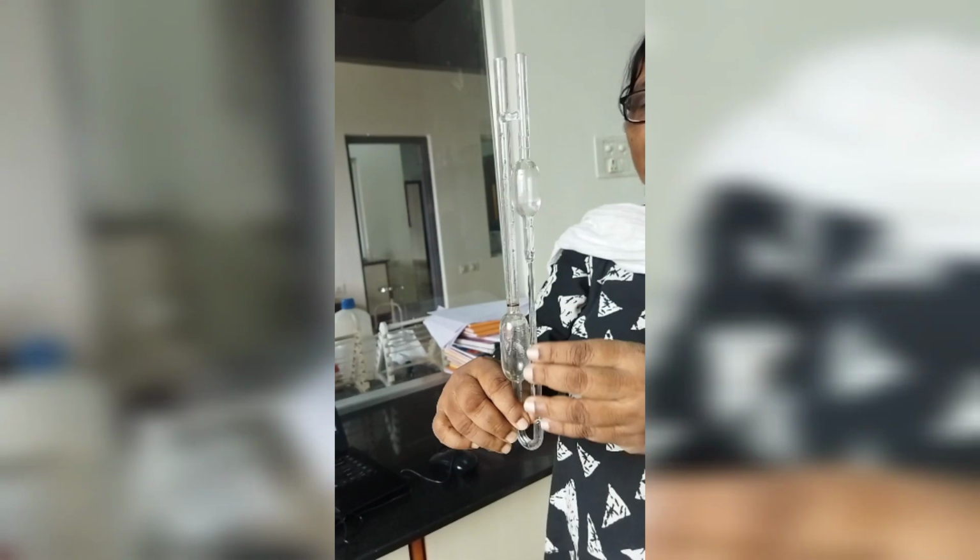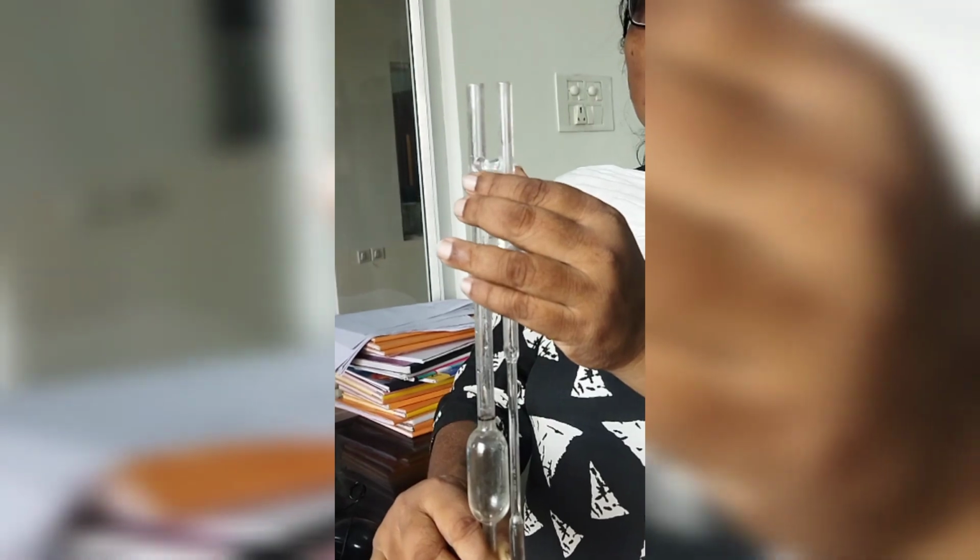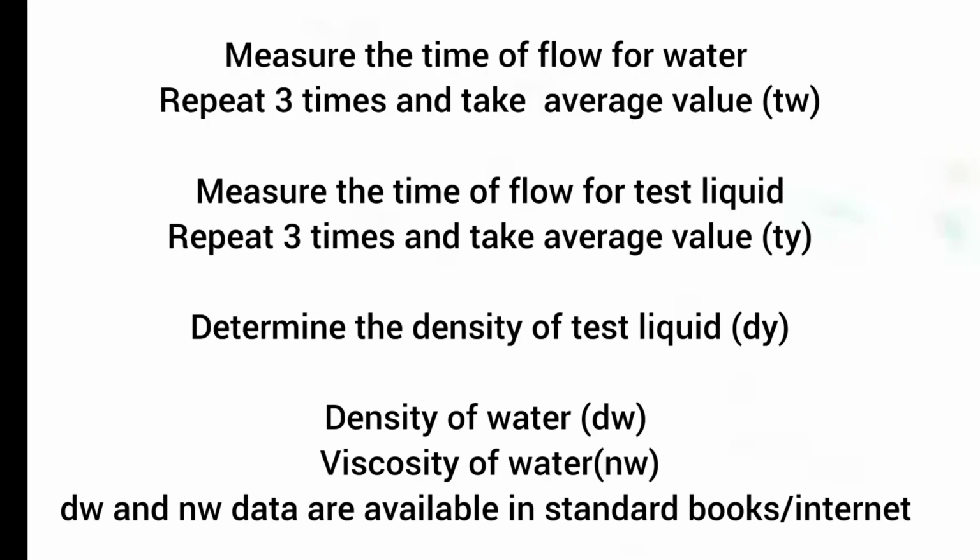It will take a little bit of time as it fills, because when it passes through the capillary, the movement is bound to be slow. It comes slowly, it will go up also slowly. So slowly we'll be seeing it going up. Then measure the time of flow for water.